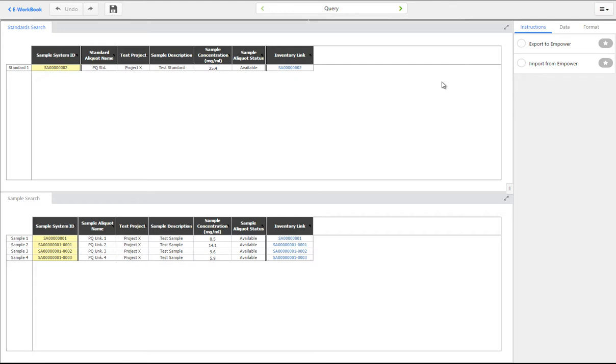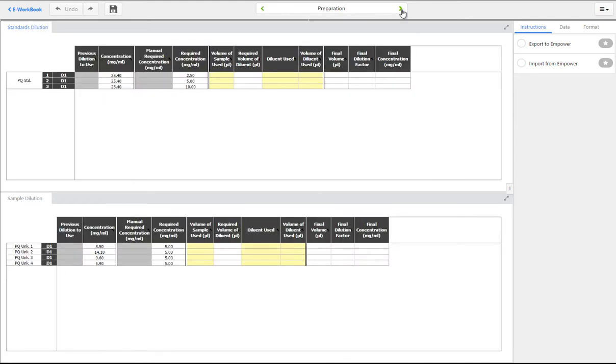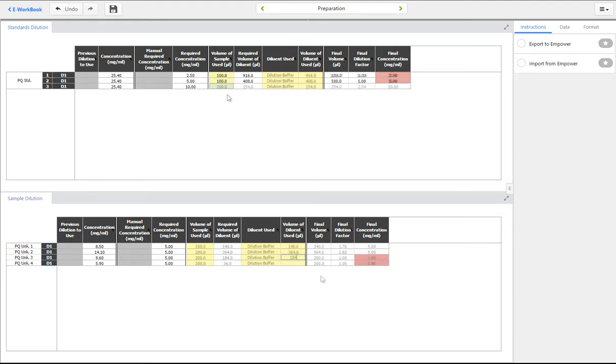The information about your samples can be retrieved from your inventory system and any preparation steps recorded as defined in your eWorkbook spreadsheet template.